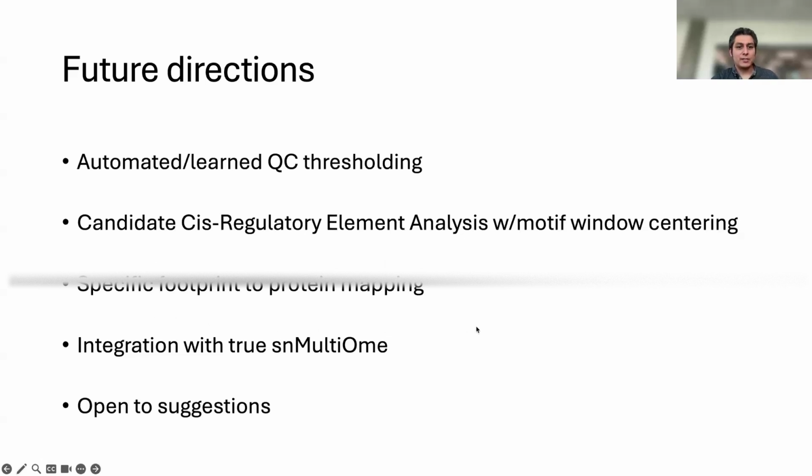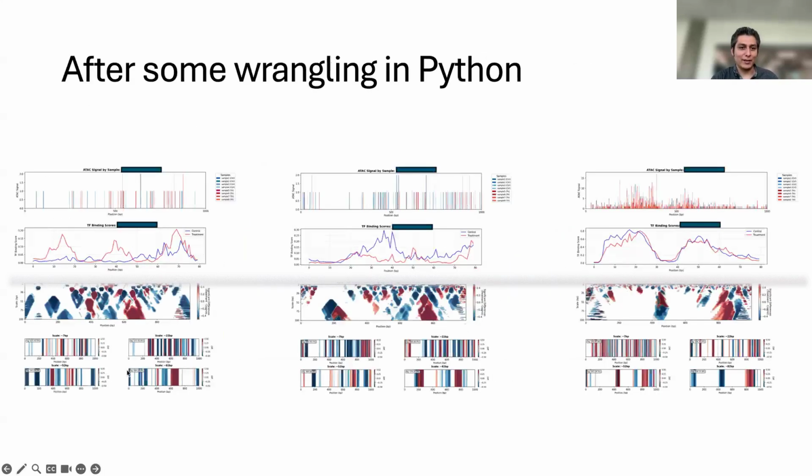Yeah, the last parts of this are just how do you know what specific proteins are mapped at what levels? I suspect we're going to have to go in depth at each one of these levels and be like, where would a nucleosome leave a footprint? And then kind of work backwards from there and work backwards from the specific transcription factors that you know you have motifs for.